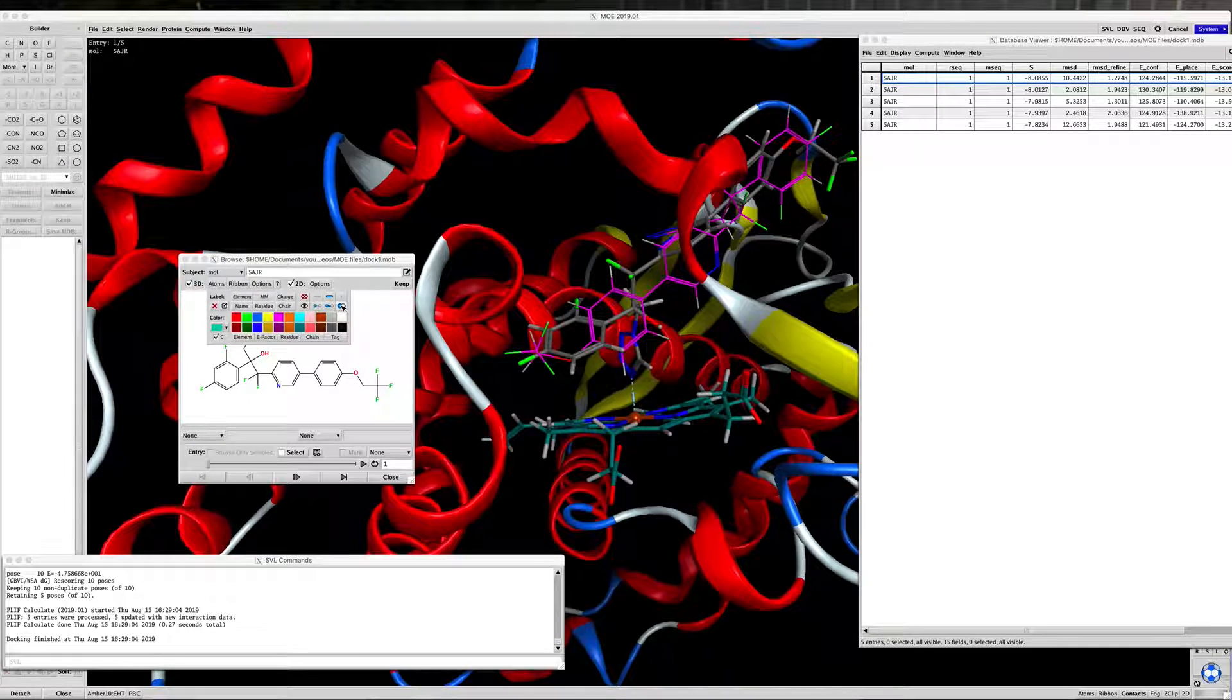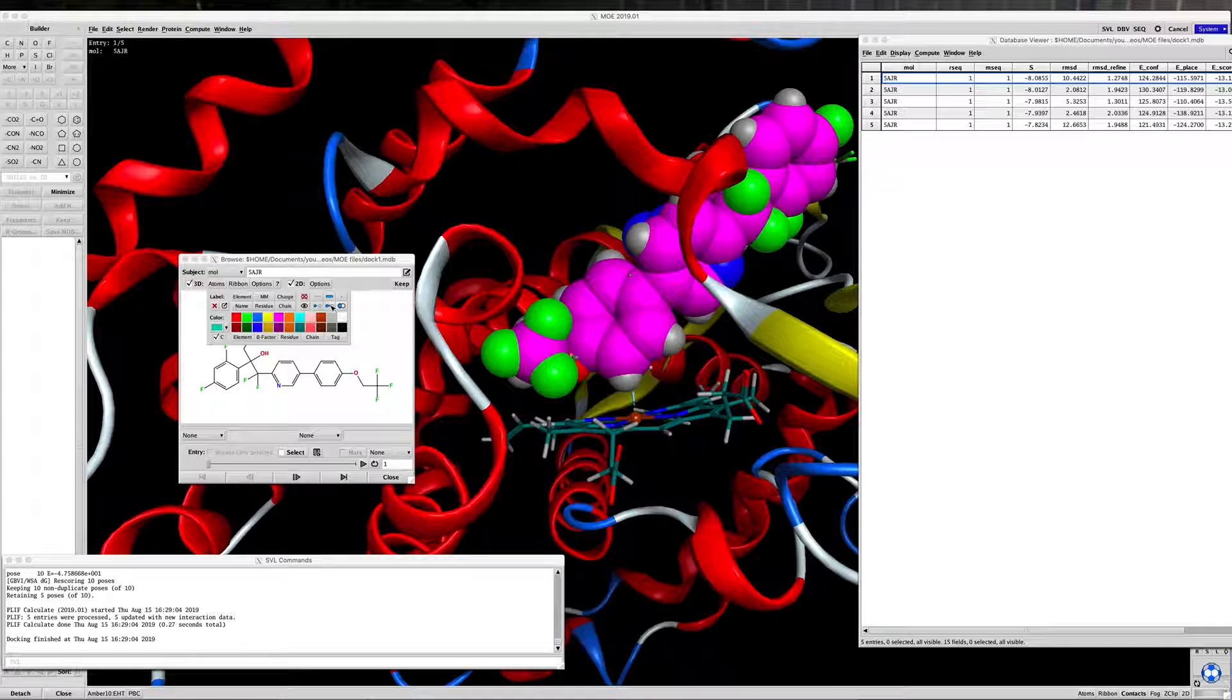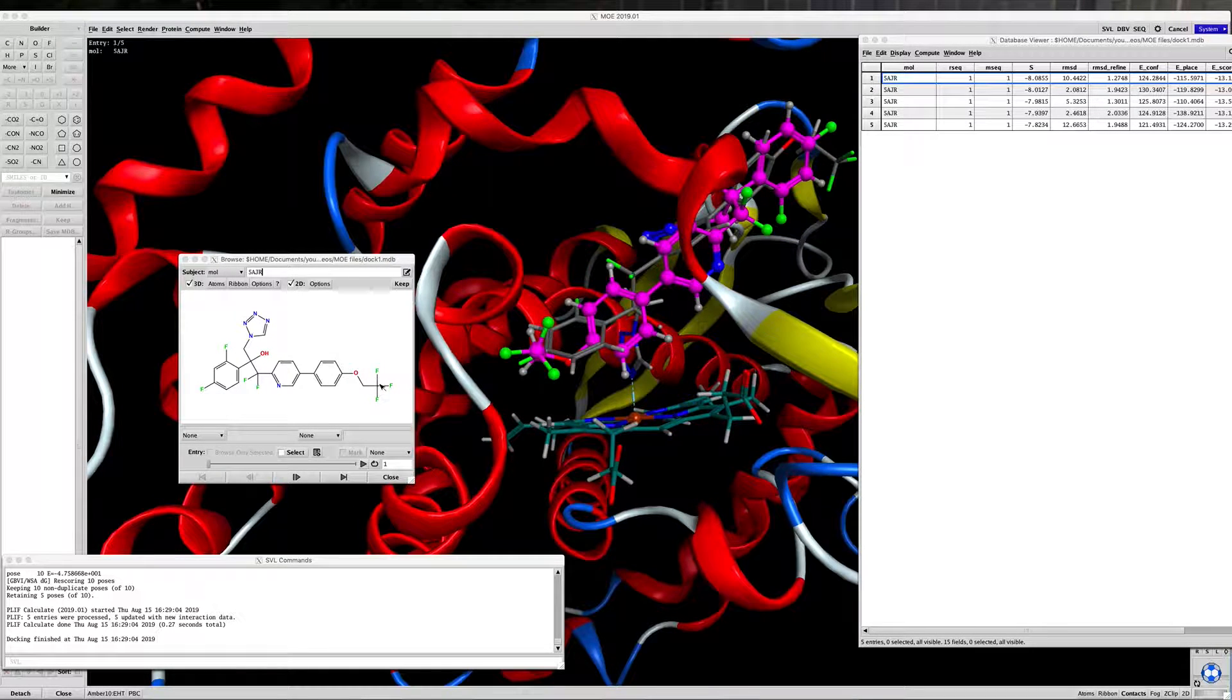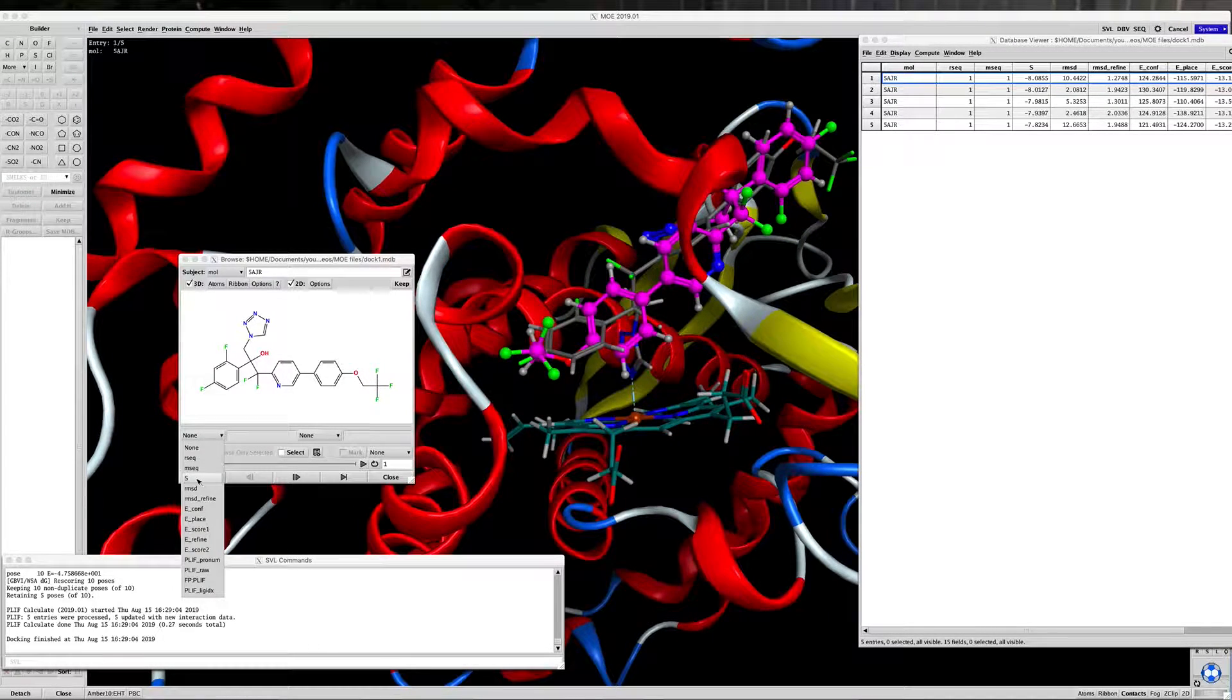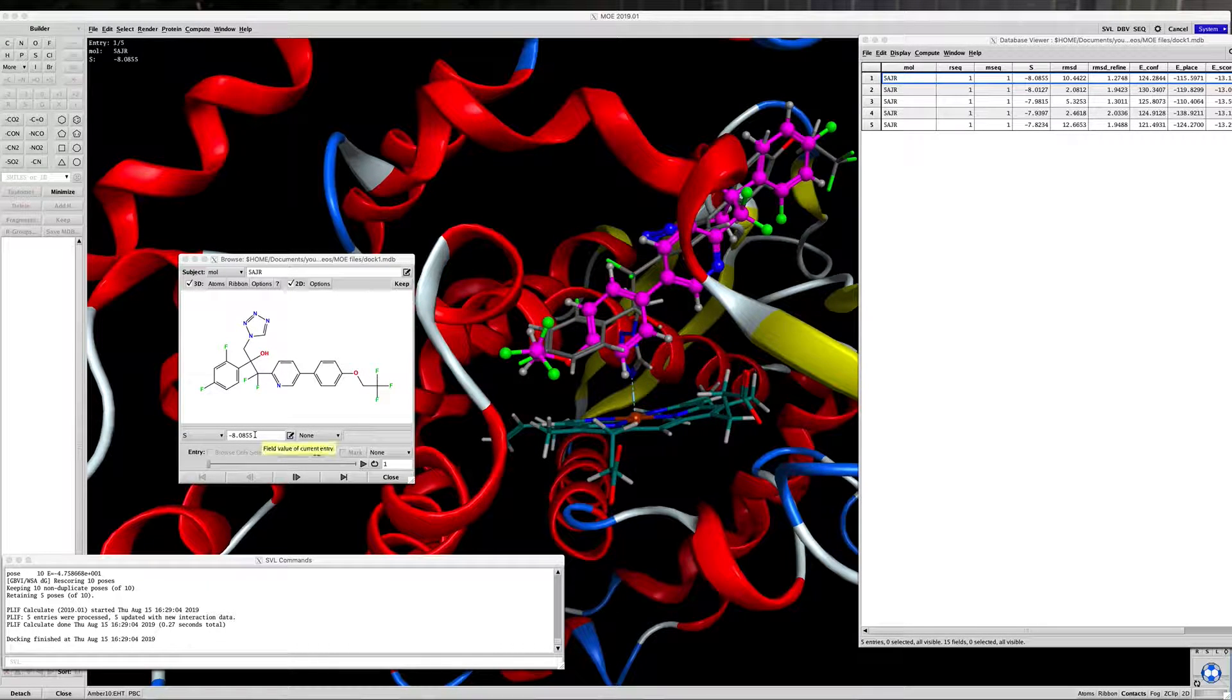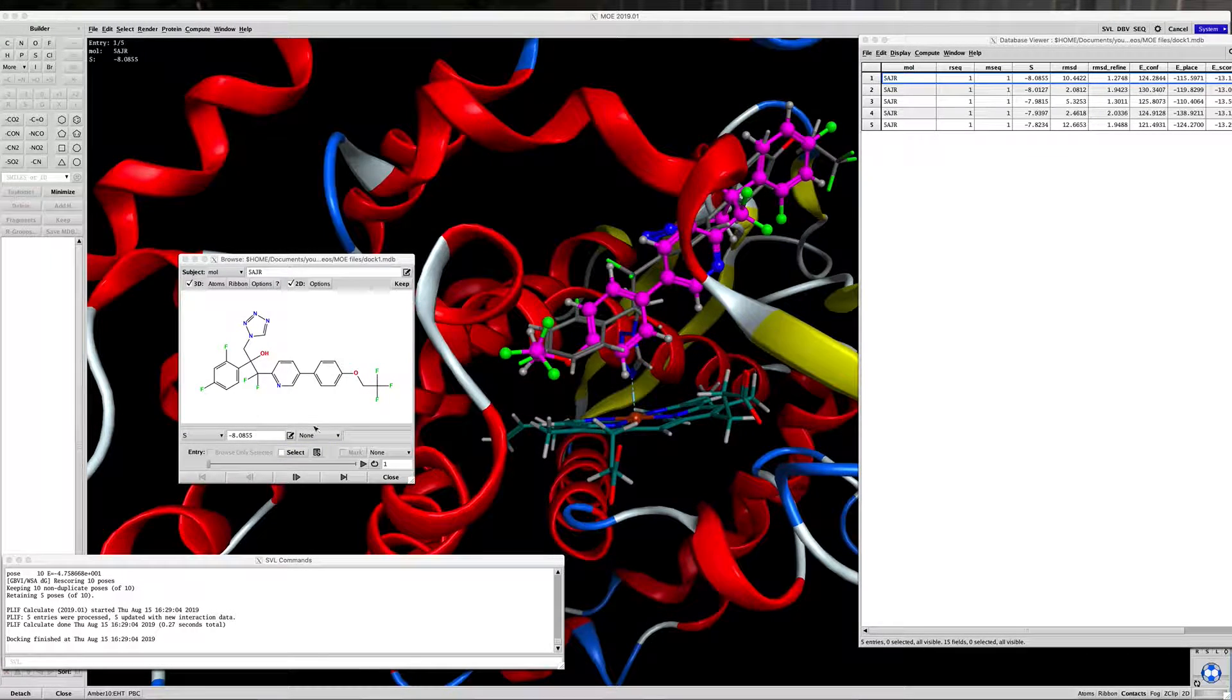Let's change the color of the atoms to purple. Let's do a ball and stick so we can easily see what's going on, and you can pull down the menu here to S, and that will display the docking energy in kcals per mole.